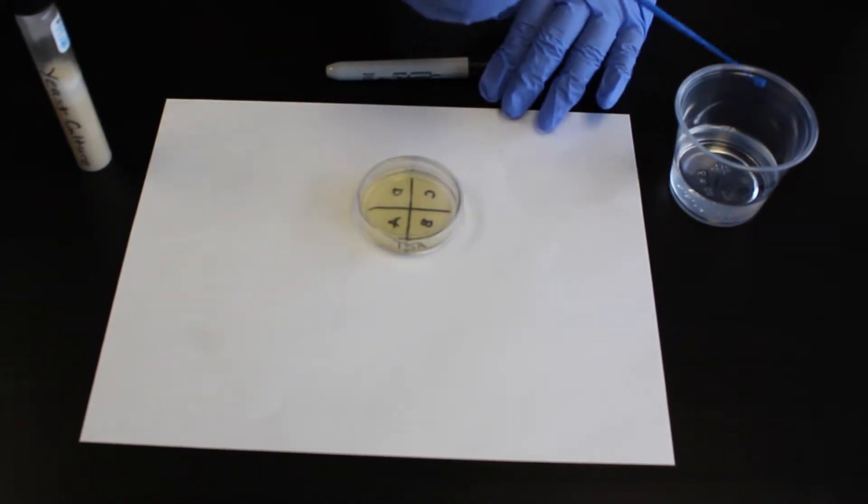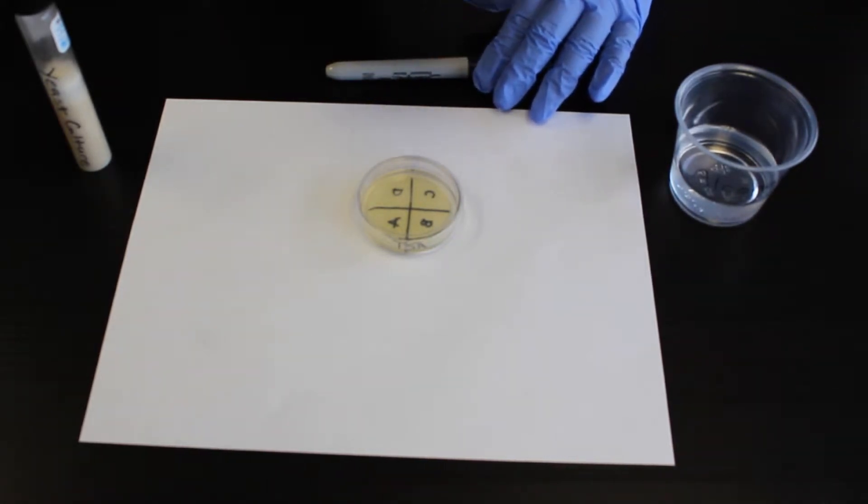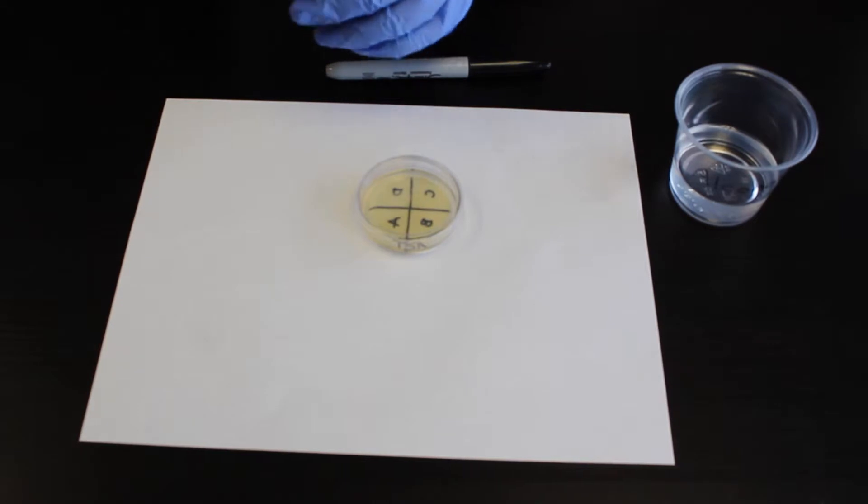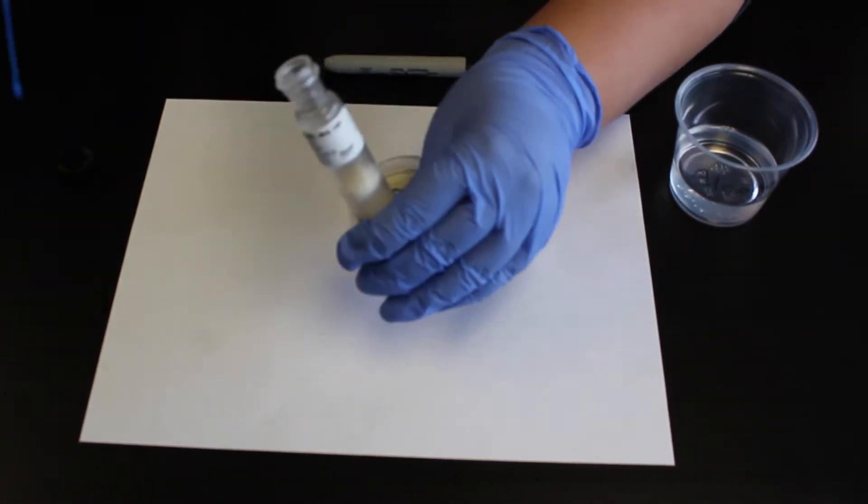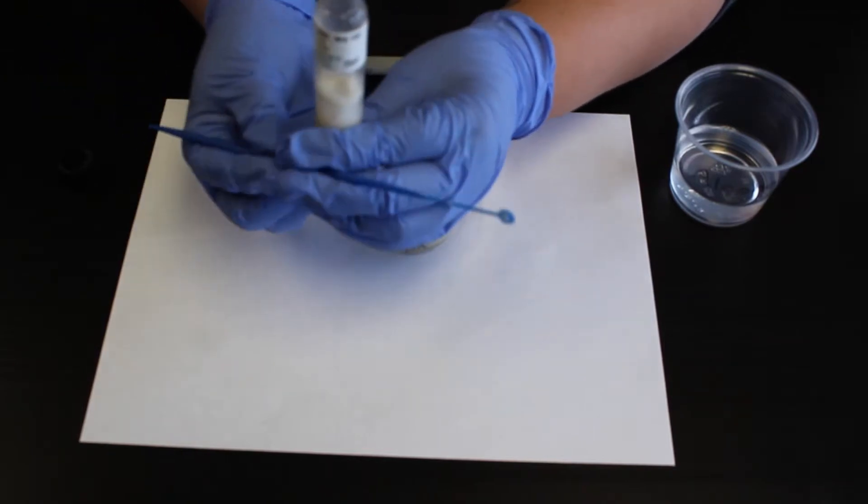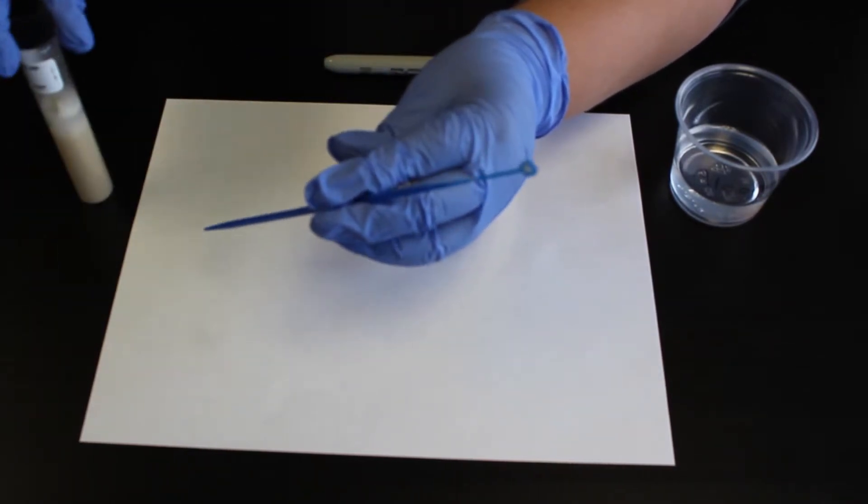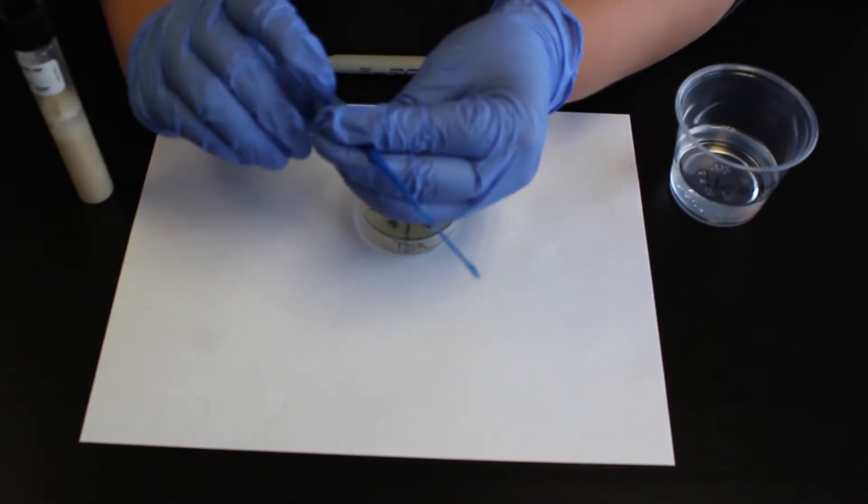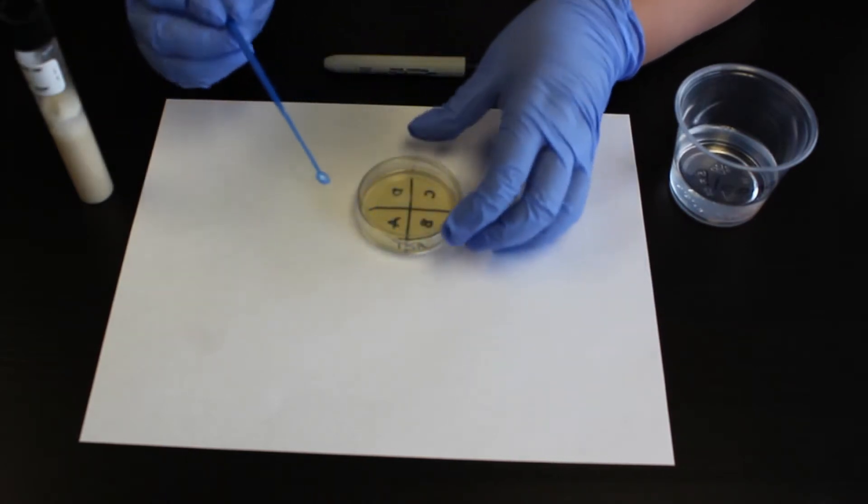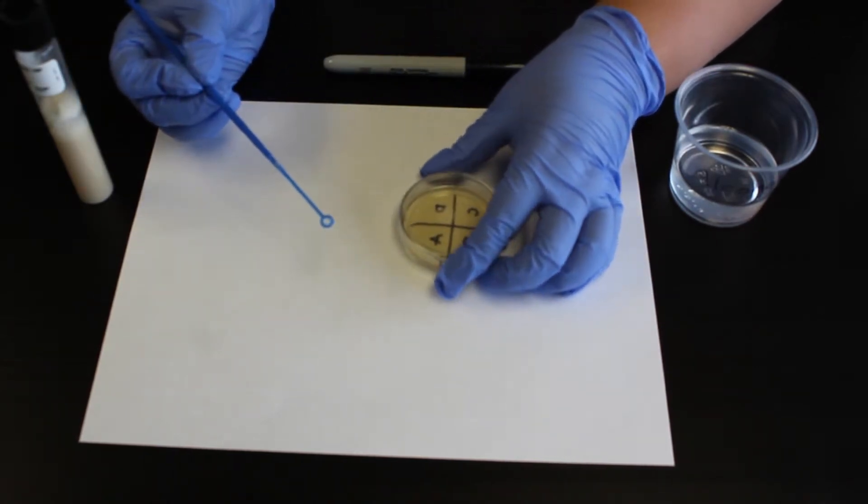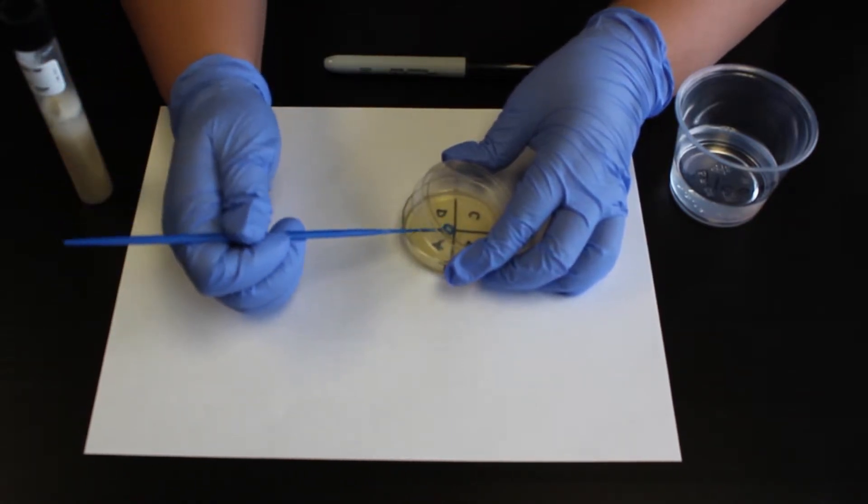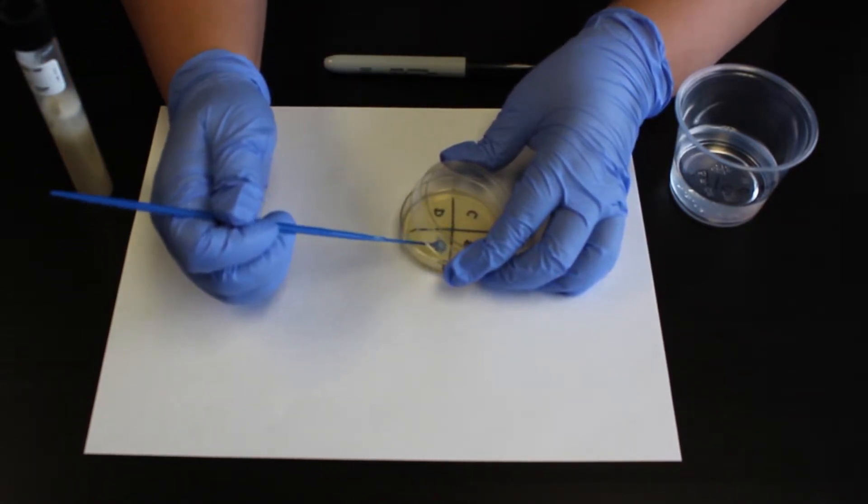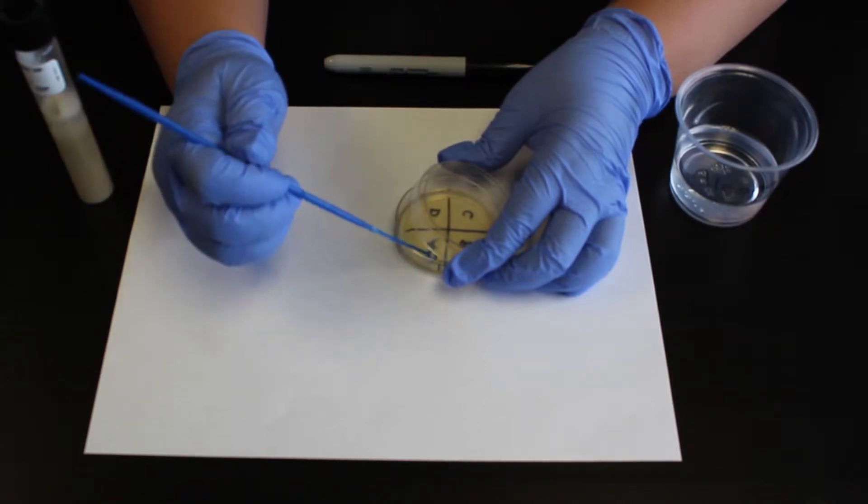Remove the loop from the alcohol and sling to rapidly dry. While holding the dry sterilized loop in the dominant hand, grasp the agar plate with the other hand, tilting the lid such that one centimeter space is opened above the A quadrant. Insert the loop and streak the A quadrant using a zigzag motion.